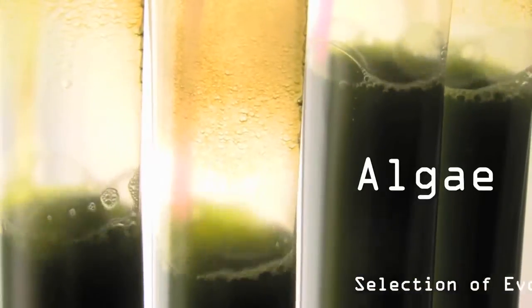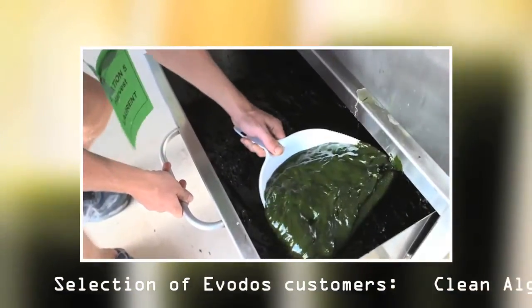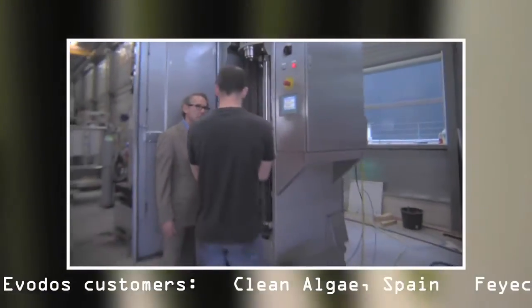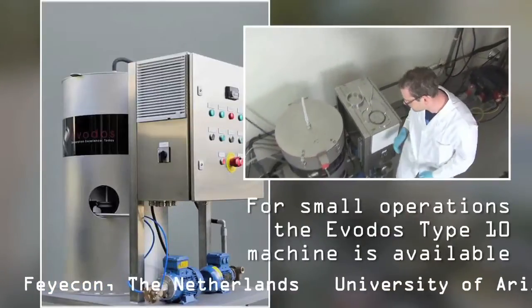Algae are used more and more for research and for industrial purposes. To get them out of the water always has been a challenge. With Evodos, you can overcome this hurdle. Your algae will be harvested alive and without free water. For small operations, the Evodos Type 10 machine is available.